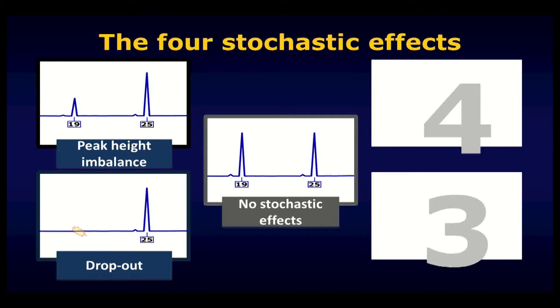An extreme example of peak height imbalance constitutes the second kind of stochastic effect: the phenomenon known as allelic dropout. Here, not only is there an imbalance in the height of the 19 and the 25, but the 19 has failed to be detected altogether. What had begun as a sample from a heterozygous individual with two different alleles at this locus now appears, for all intents and purposes, to have come from a homozygote — somebody with two copies of the 25 allele, with no indication that there was another allele there at all.